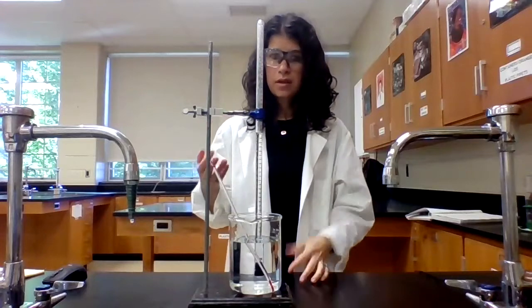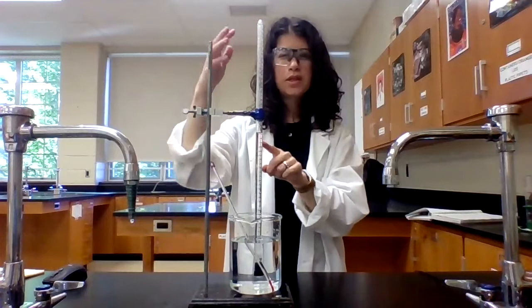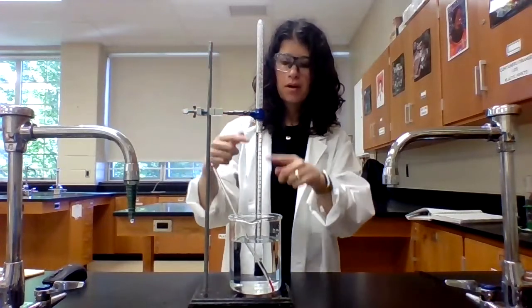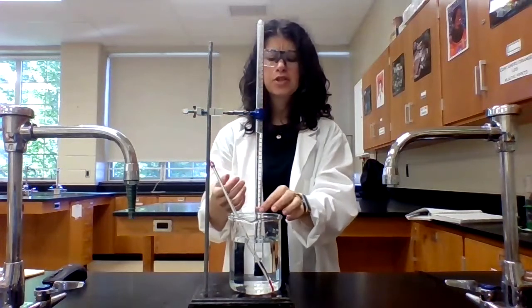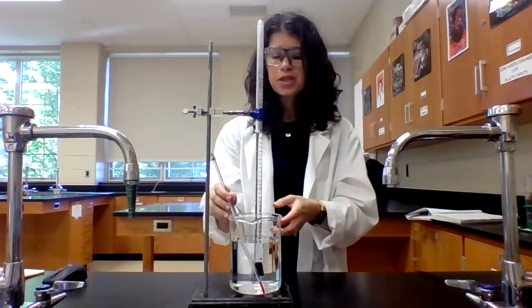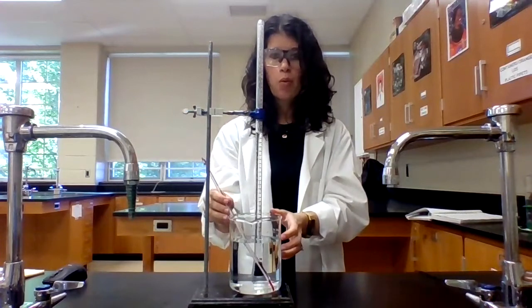So as you can see, the reaction produced approximately 26 milliliters of hydrogen gas. So the hydrogen gas is up here. Here's the rest of the water and any extra hydrochloric acid down here at the bottom. I do need to record not just the room temperature, but also the temperature of this water.